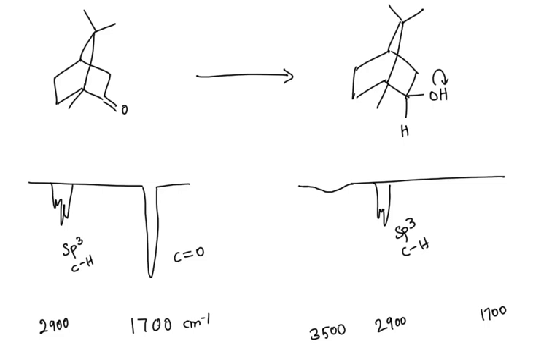Right. But you should not see this peak. That is important in your IR spectroscopy. There shouldn't be a 1700 peak. Okay. That tells the completion of the product.